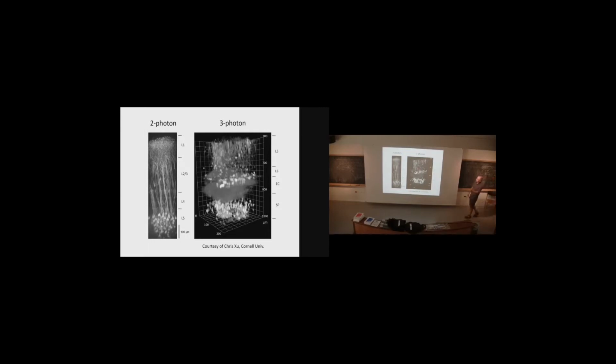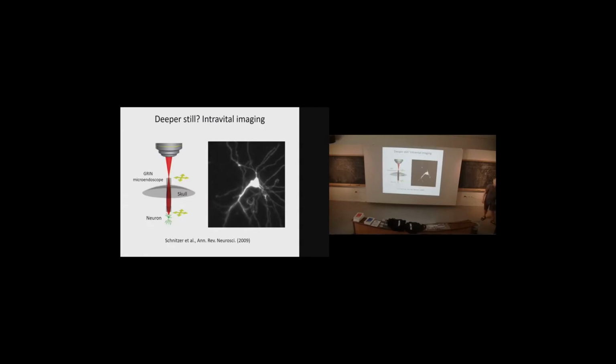And so here's an example. That's that image I showed you previously. These are layers inside the brain. This one goes maximum, maybe you can go to layer 5 inside the brain, which is about 0.5 millimeter deep. This starts at layer 5 and keeps going, down about 1 millimeter, past what's called the white matter inside your brain, which, as far as light is concerned, is almost impenetrable, and they actually go beyond that, which is remarkable, just by going to longer wavelengths.